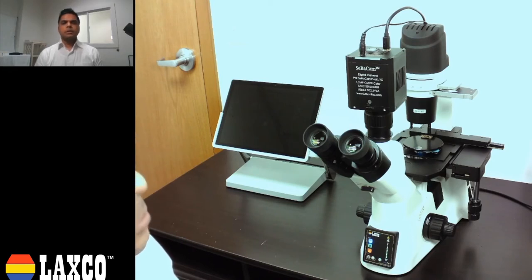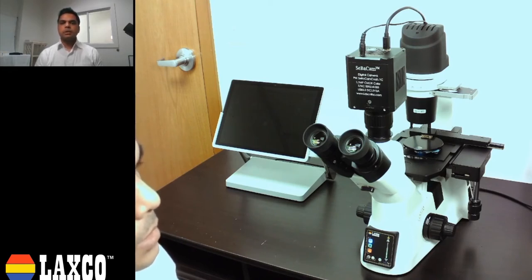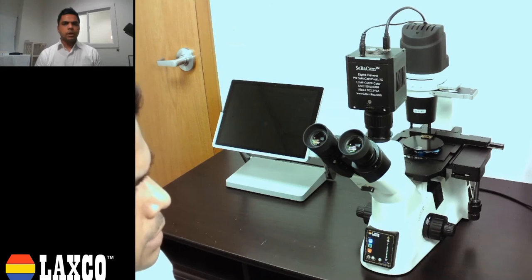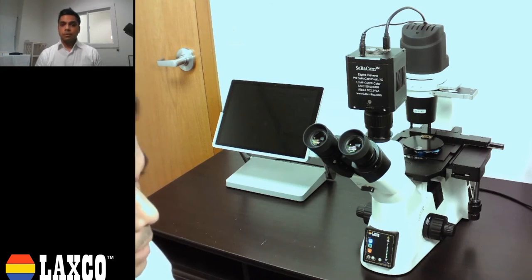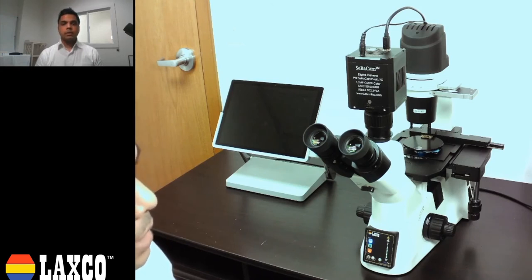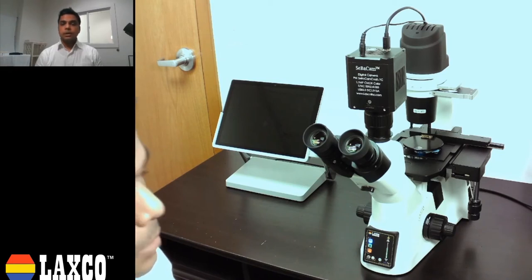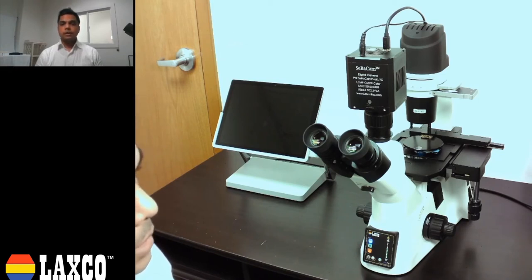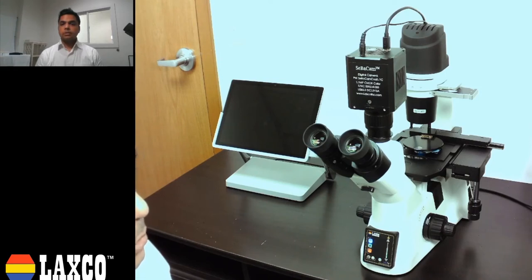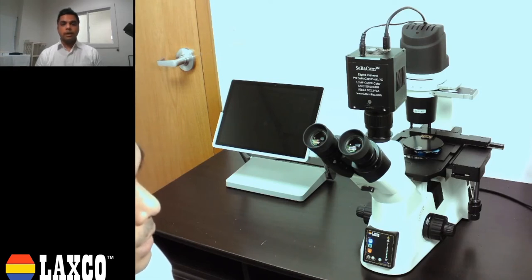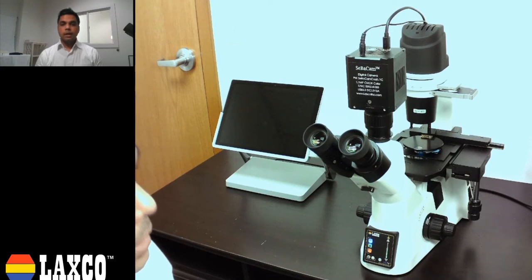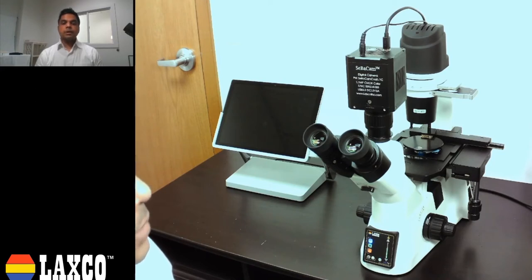Before we start the presentation, I have a couple of questions. Are you someone who is investing a lot of time in processing multi-channel fluorescent images of your sample? Do you take static images in independent channels, assign pseudo color to them, and then finally stack them to produce the final image? Well, this is a presentation for you.